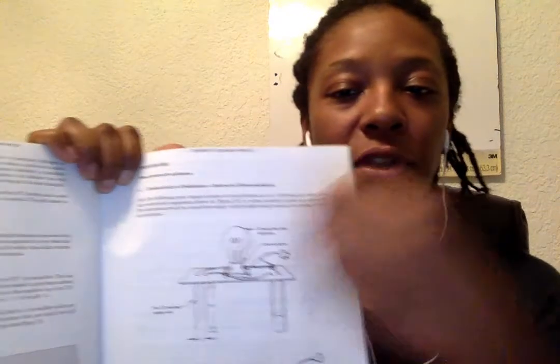Okay, and so that's basically wherever you feel that solution ends up, right? So if you feel like, okay, this first one is distilled water, so that one I have as a non-electrolyte. So that means there was no light that came on. Okay, so that's what you want to do for experiment 13.